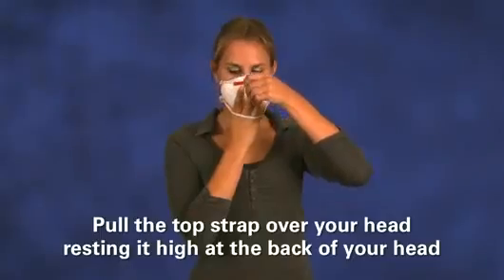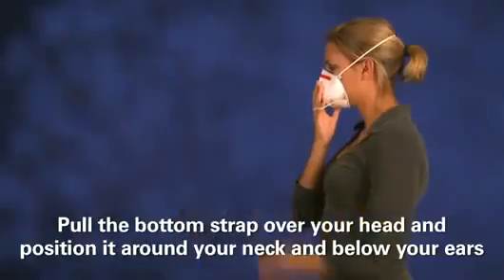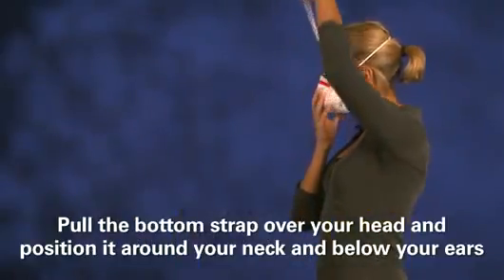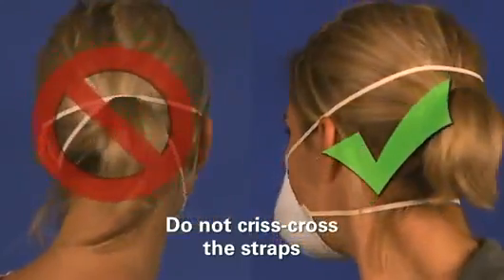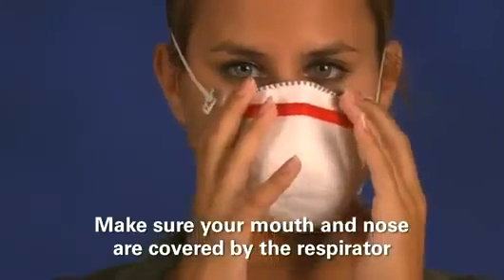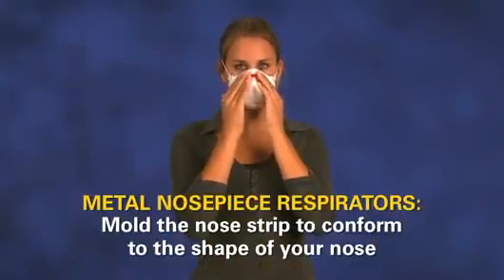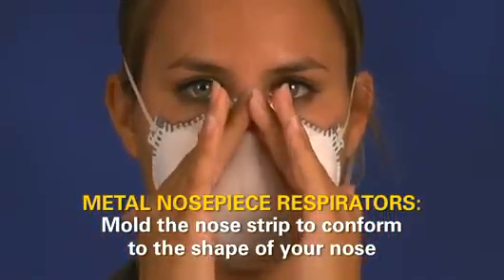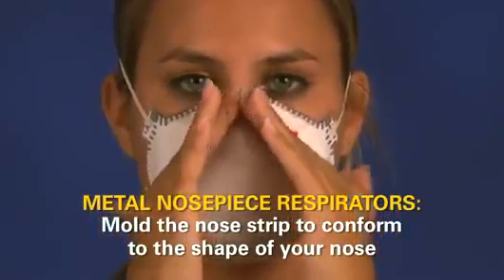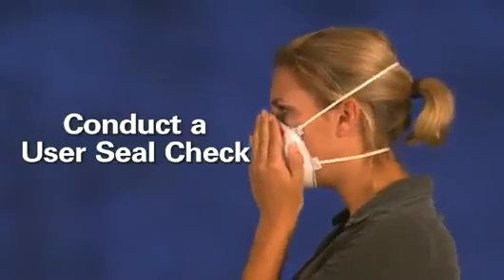Using one hand, place the respirator on your face with the nose piece at your fingertips, allowing the headbands to hang freely. The nose piece should span and cover the bridge of your nose, and the respirator should cup your chin. Pull the top strap over your head, resting it high at the back of your head. Pull the bottom strap over your head and position it around your neck and below your ears. Be sure not to crisscross the straps. Make sure that your mouth and nose are covered by the respirator. If the nose piece has a metal nose piece or strip, use both hands to mold the nose strip to conform to the shape of your nose by pushing inward while moving your fingertips down along both sides of the nose piece. Next, conduct a user seal check.